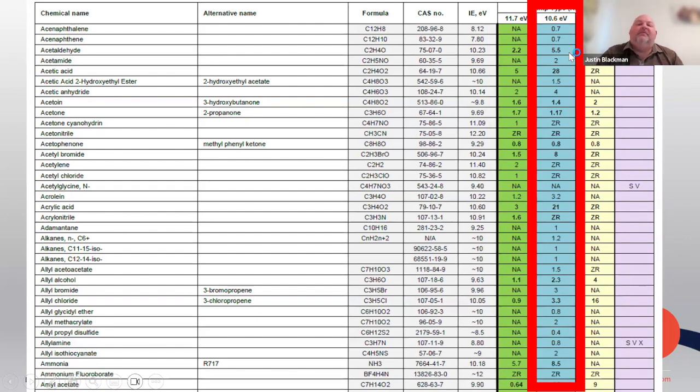If there were, let's say, 1 ppm of something else, not acetaldehyde, but some other volatile in the air, the instrument would also multiply its response on the screen by 5.5 and give us potential numbers that we don't understand, and we might just call those unneeded interference.